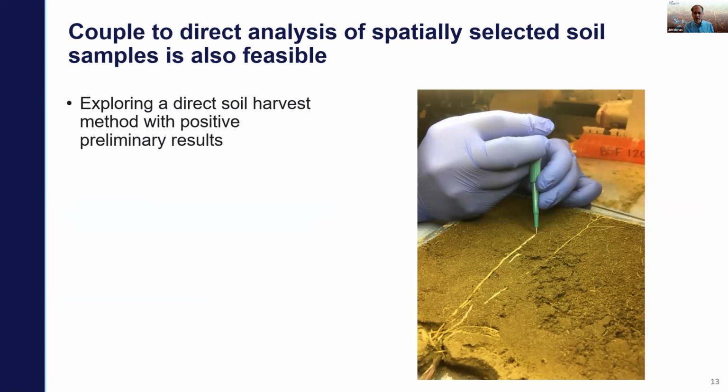This is really enabled by some of the microfluidic proteomics processing capabilities that have been developed at PNNL and specifically EMSL. And I can't stress enough the small amounts, tens of milligrams of soil, something like that. By taking such a small sample, it's giving us the ability to really spatially target where that sample comes from.